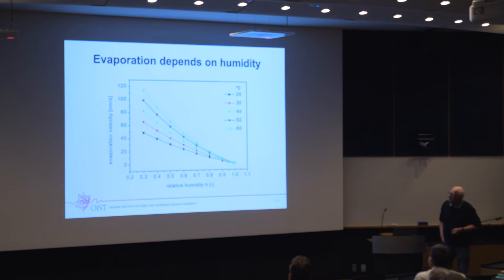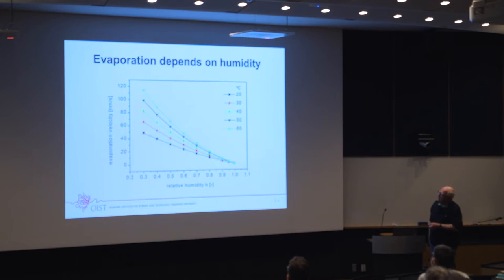There are some tricks. And one of the tricks is that when you do the plunging into liquid ethane, it has to be controlled. Here you see evaporation velocity in nanometers per second. Your specimen is hopefully something like below 50 nanometers, right? And if you see here that you evaporate like 50 nanometers per second, then you don't want to do it in a dry climate.